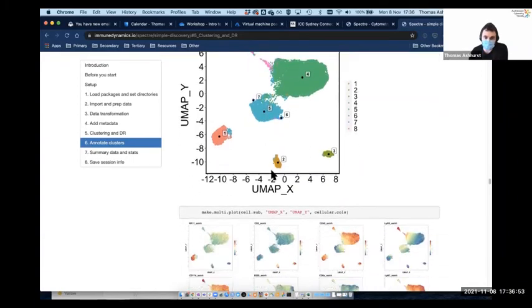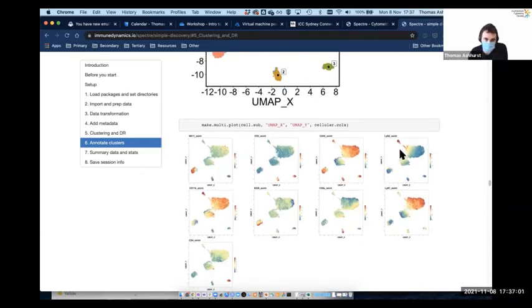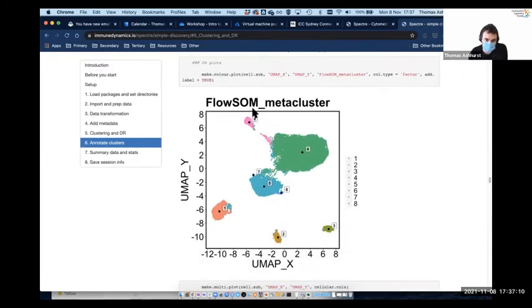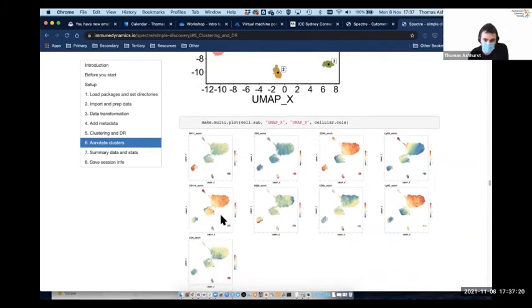Then what we get to do is look at the cellular expression data and make some decisions about what cluster belongs to what cell type. Just as an example, one of the classics, Ly6G, which is always highly expressed on mouse neutrophils, is on this little island at the top. So we would infer that cluster 8 is mouse neutrophils, and we can annotate it that way. And we can go through this entire process by annotating clusters based on what we know about their biology.